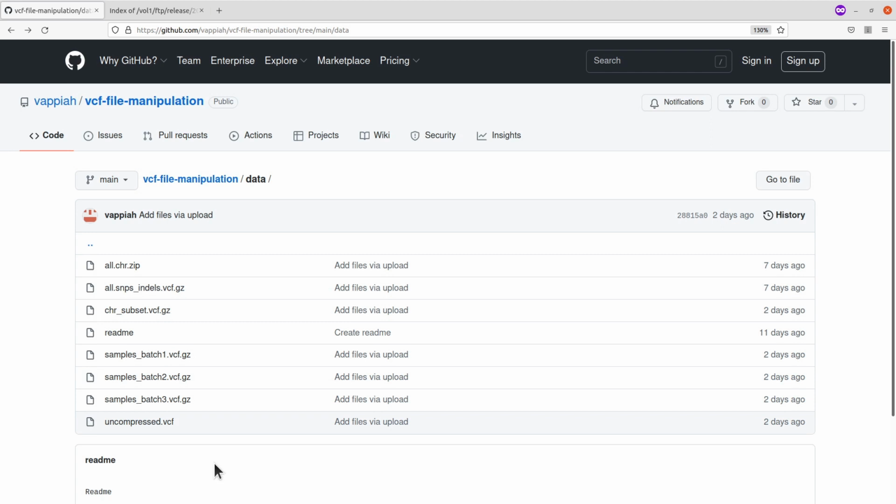They are very, very small in size. So you can download them quickly and easily and use them on your PC without any challenge. You can use them on ordinary PCs. So that's how it is. Let's download the data.